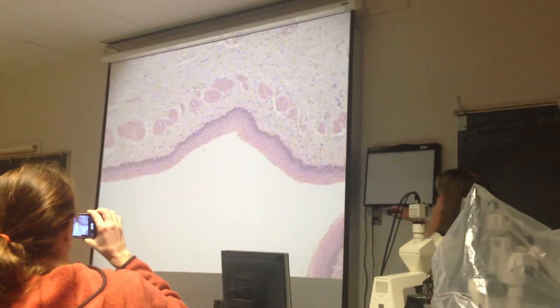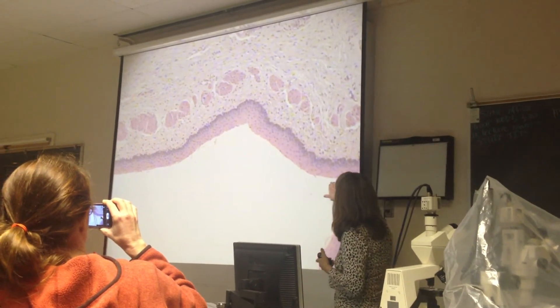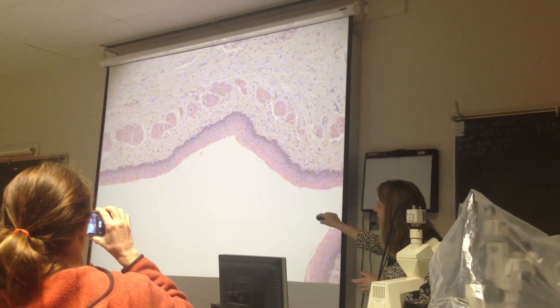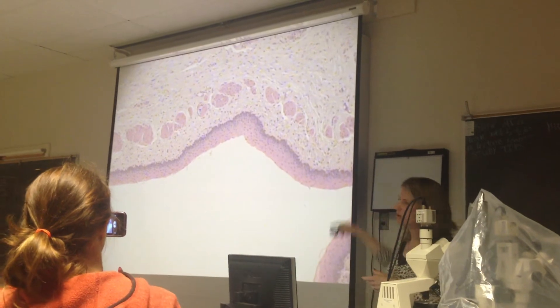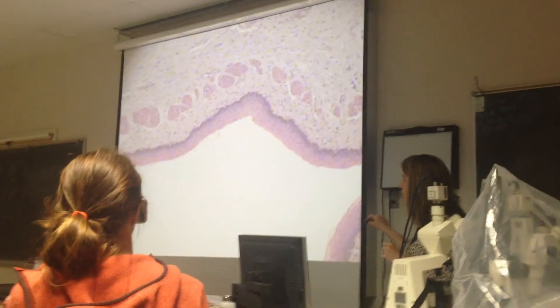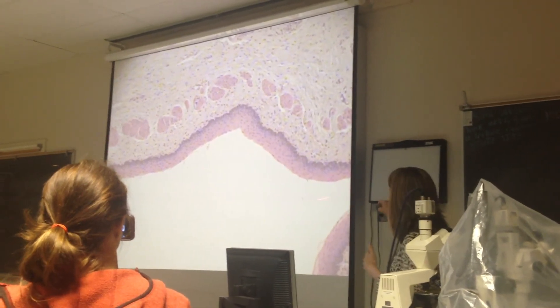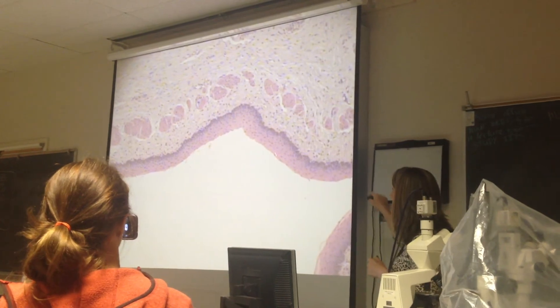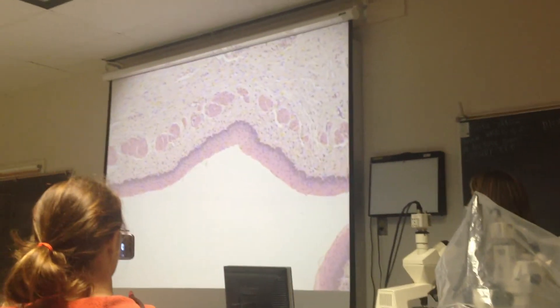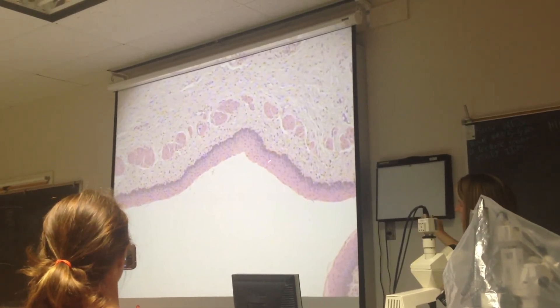The easy way to tell — I'll move up magnification again — is that there's not a kind of a dead, wispy layer here. If you have a wispy, dead-looking layer, then you know it's the skin. Sometimes it's a very thin wispy layer, and sometimes it's a big thick one, like the big blue thick layer that was the palm and sole of the foot. So this is the wet, non-keratinized stratified squamous epithelium, from here to here.